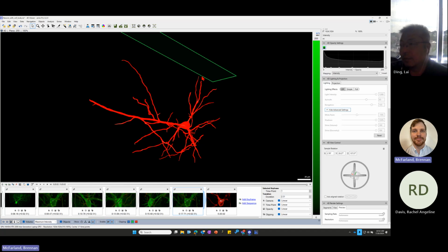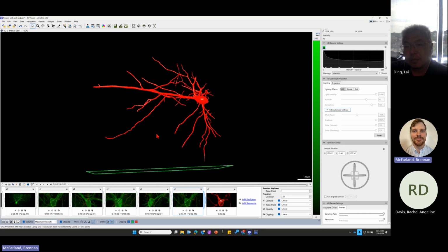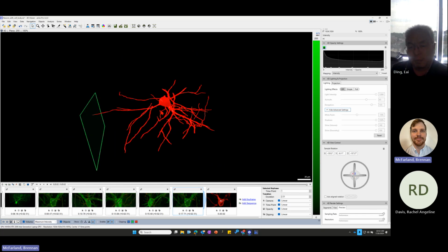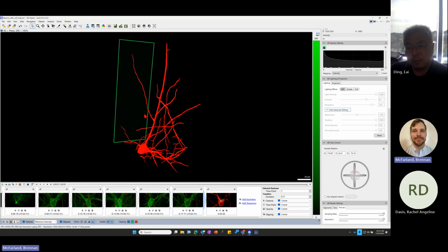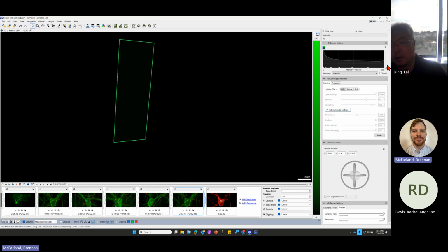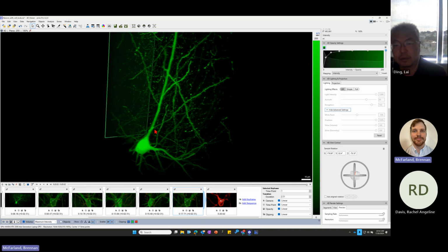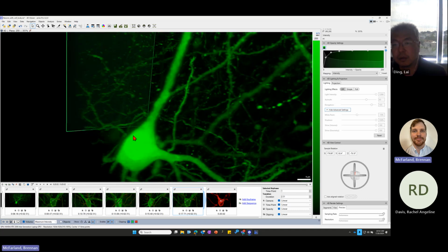But you can do a screen recording using another software or the native Windows screen recording, and then do, I'm going to move through here. Now I'm going to turn off my objects. Now I'm going to raise my histogram settings here. I'm going to zoom in. You can have a software, Windows, record all of that.